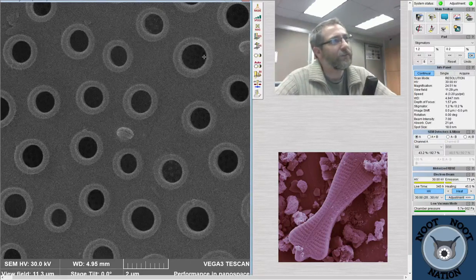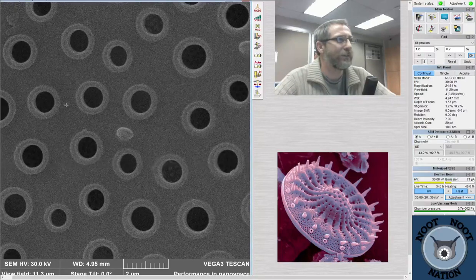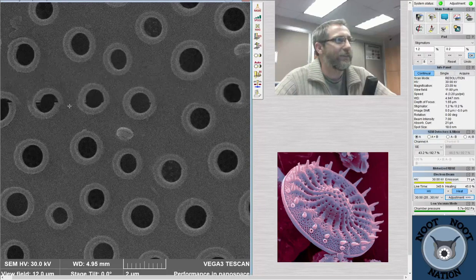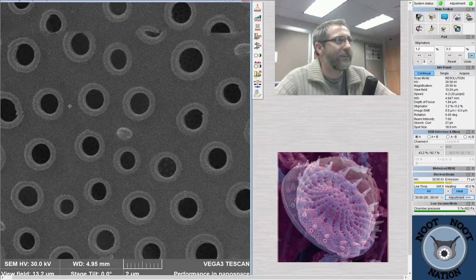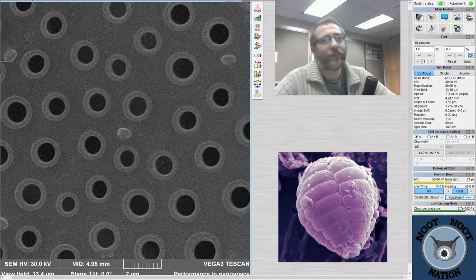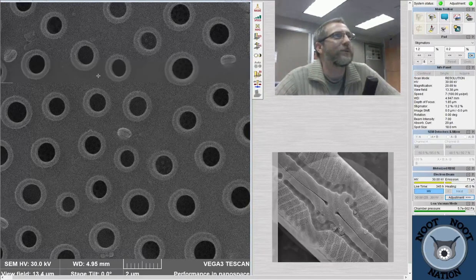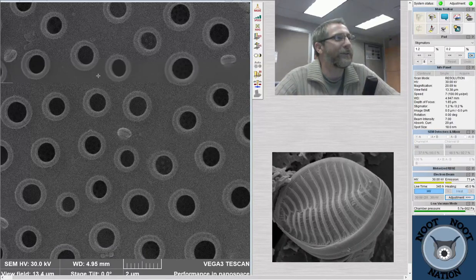You can also, if you look very closely at this image, see that inside of the holes there's a bunch of little tiny holes. So I'm going to try to get this image nice and clean for us. There you can see those little holes inside the holes. I really like this diatom, like texturally, this is appealing to me. I suppose if you don't like holes, it's probably very unappealing, but it looks like a crazy space wall with little mouths coming out of it, so.